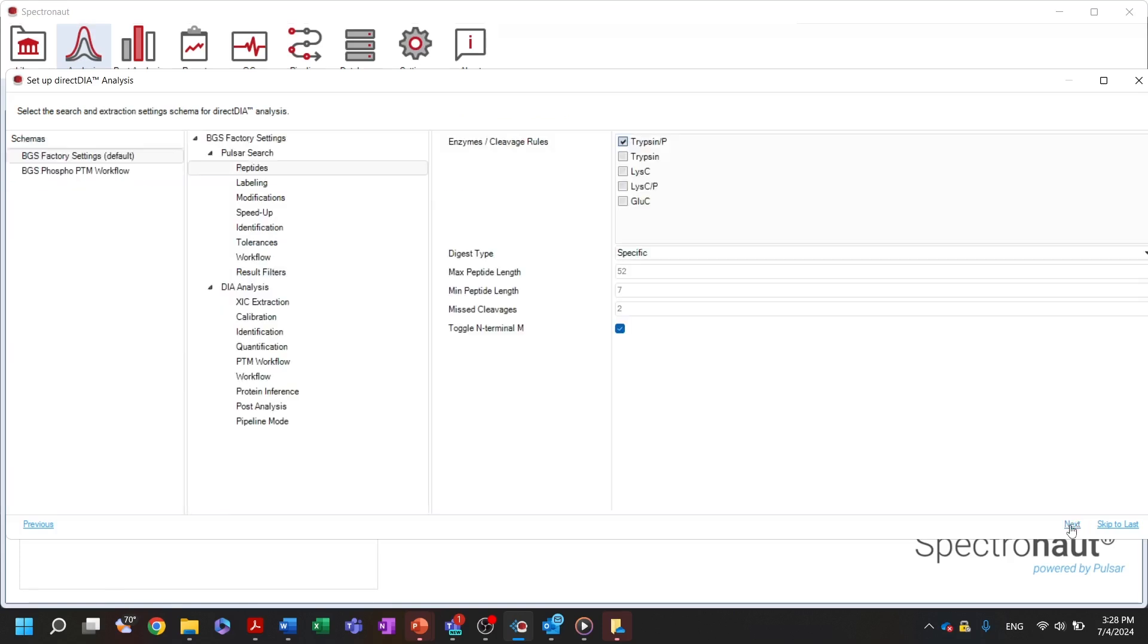When setting up a new analysis, you can select the default Spectronaut settings, as these are recommended as optimal for the majority of DIA analysis projects. Today we will talk about a few specific settings that you might want to select or change depending on your preferences and the specific characteristics of your project.